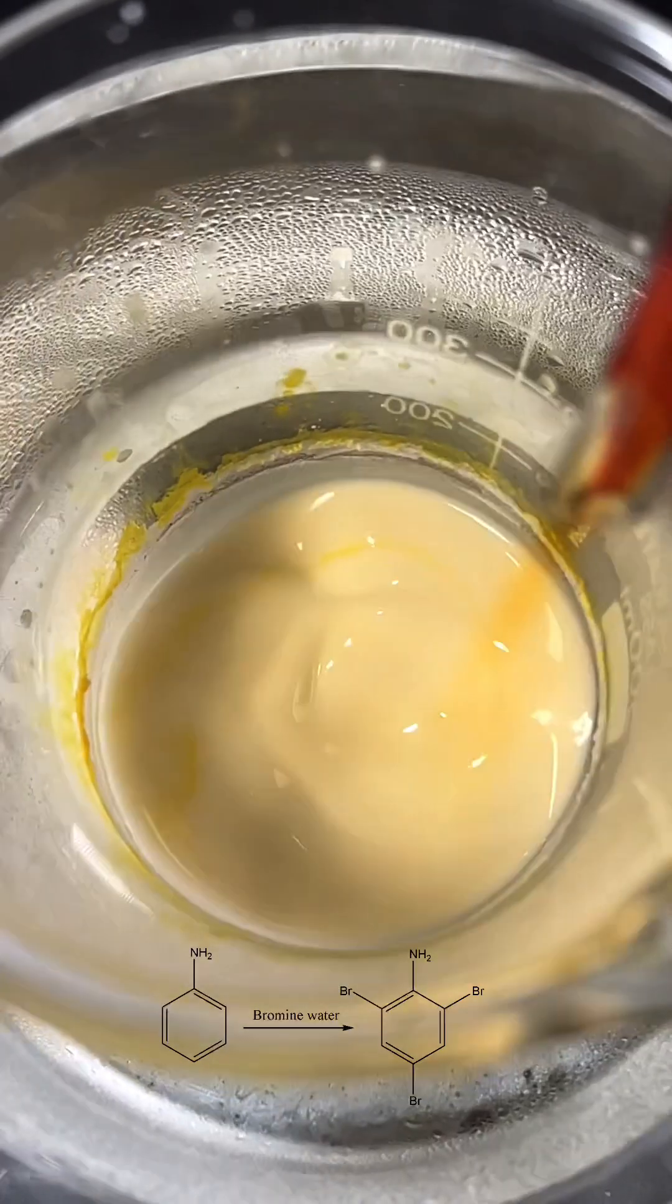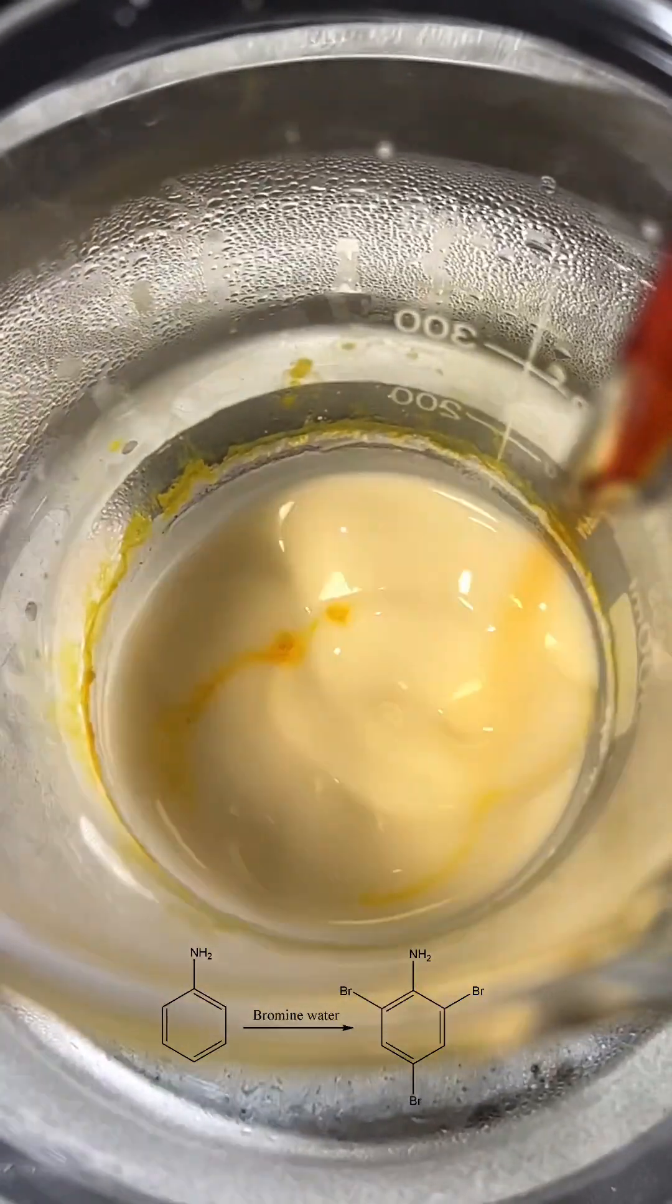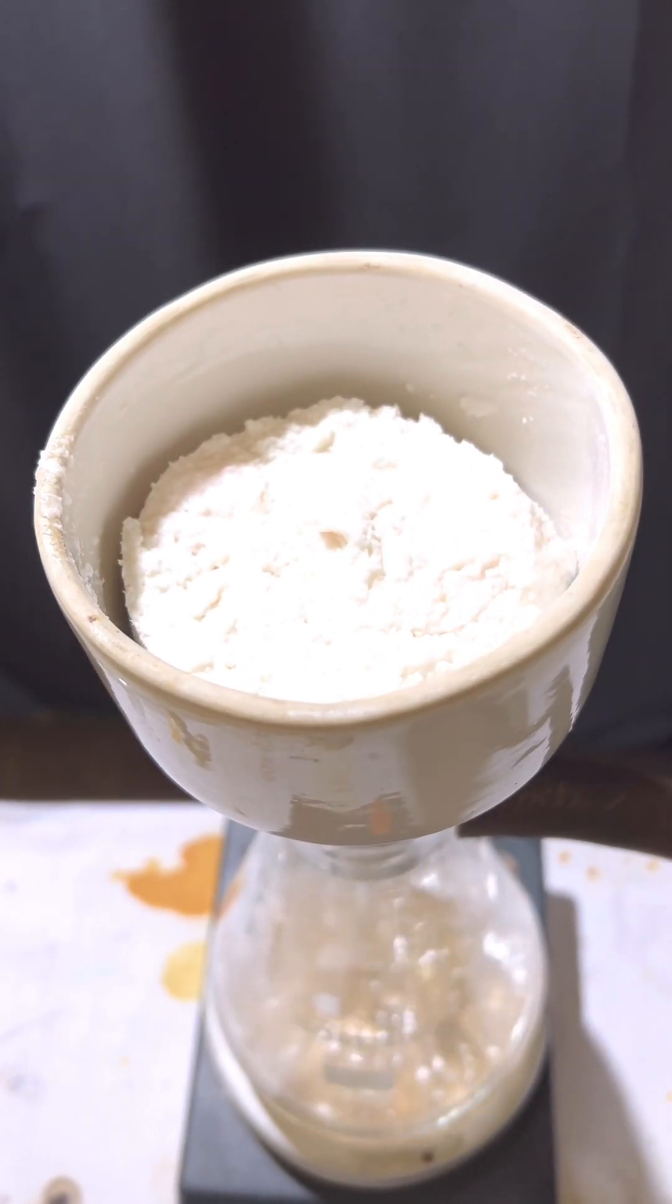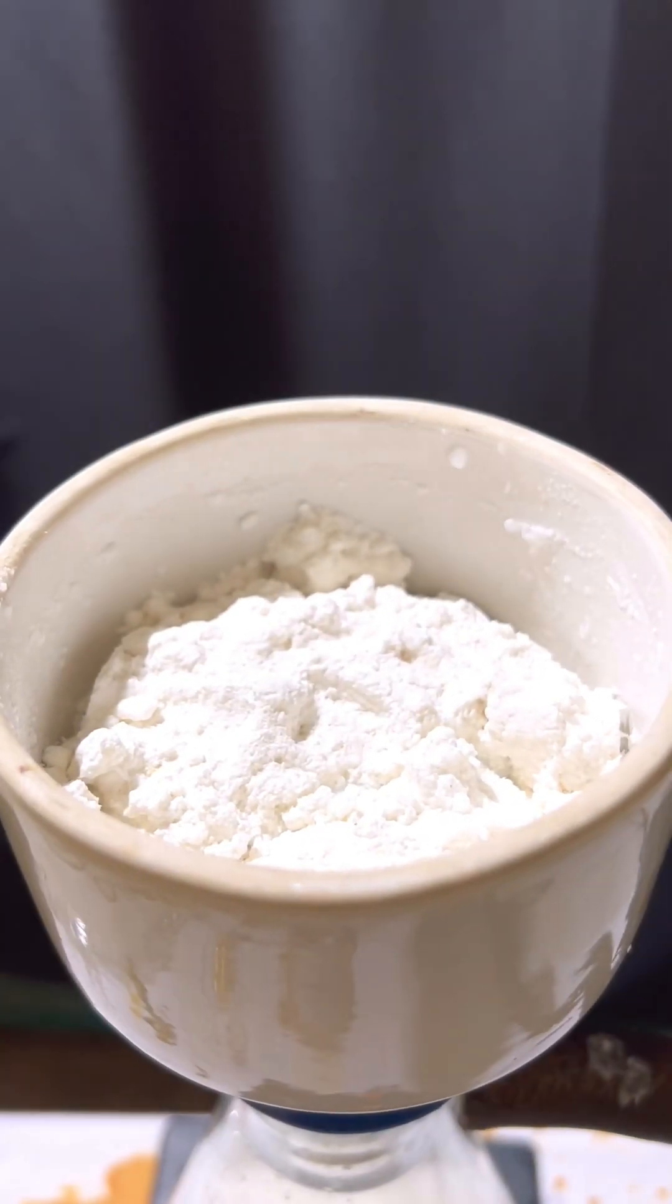You see the formation of a white precipitate. This is the crude tri-bromoaniline. Finally, the crude product was vacuum filtered and dried. It was then recrystallized from 70% ethanol solution.